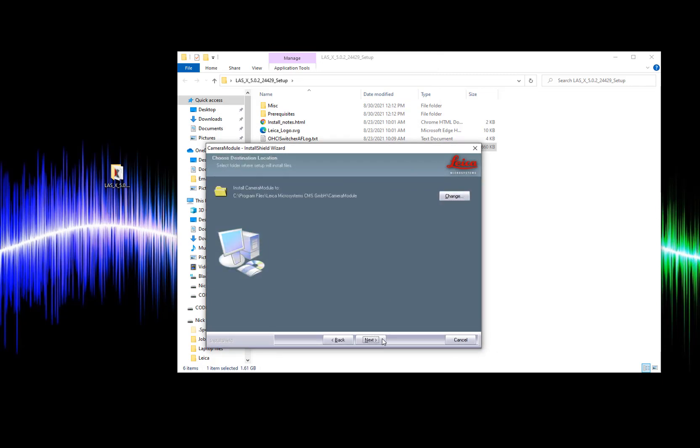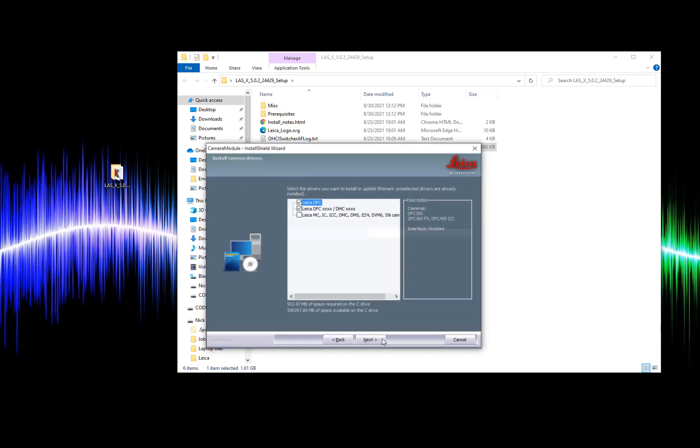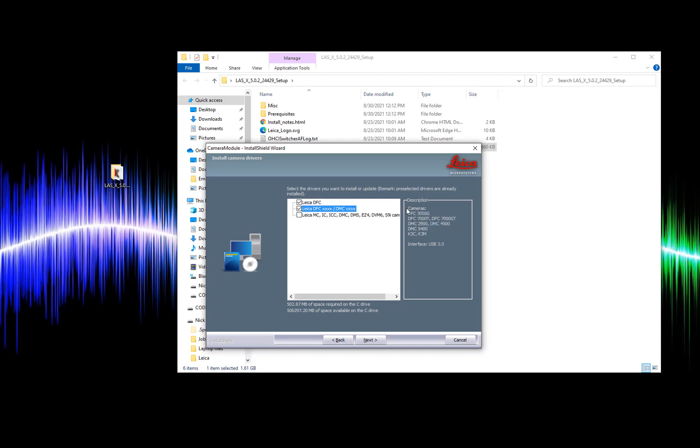From here we hit next twice. The software then detects which camera drivers are already installed on the computer. You can click on each camera driver to see the full list of cameras that driver covers. For my demo computer I'm going to check all of the drivers.